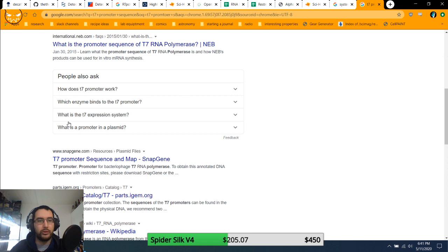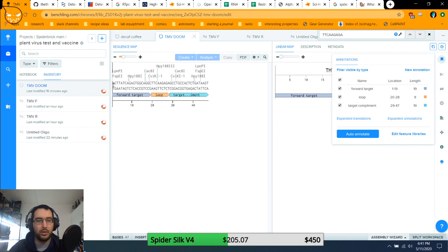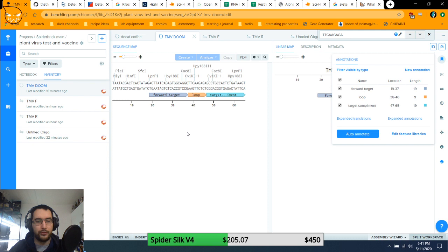So let's grab this. Come on, NEB. There we go. So here we go. This is what we want. This is the T7 promoter. So I'm going to just grab it. We're going to go back over to here, and it should let me just paste that in. And now if I click off, it is exactly 65 bases long, which is exactly what we want. Wow, that is really cutting it close. I didn't realize how close that was going to be. Oh my god. Okay.